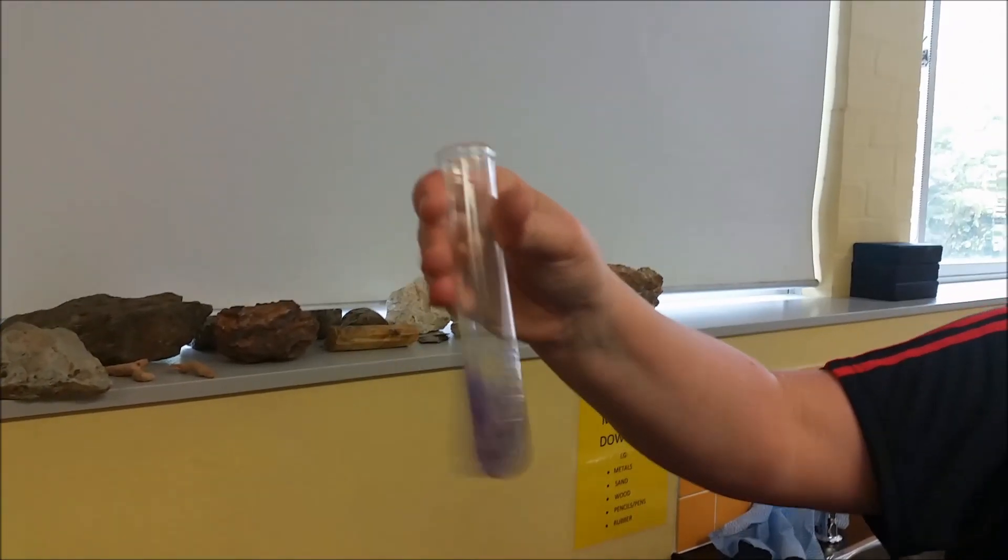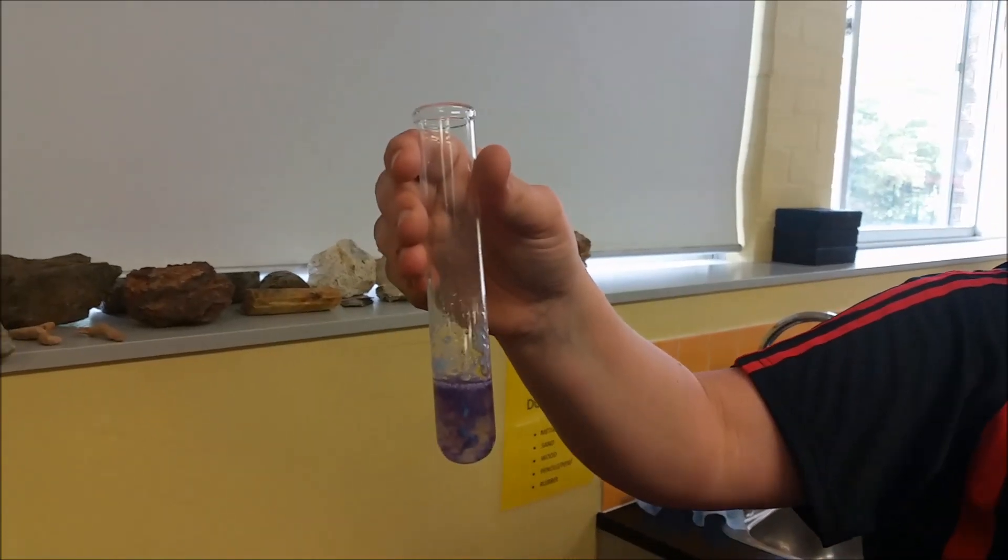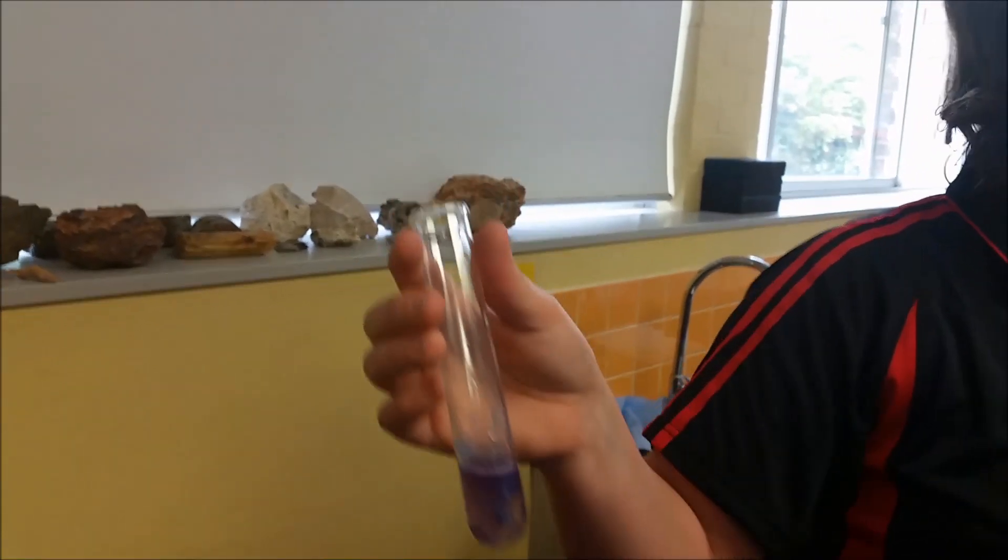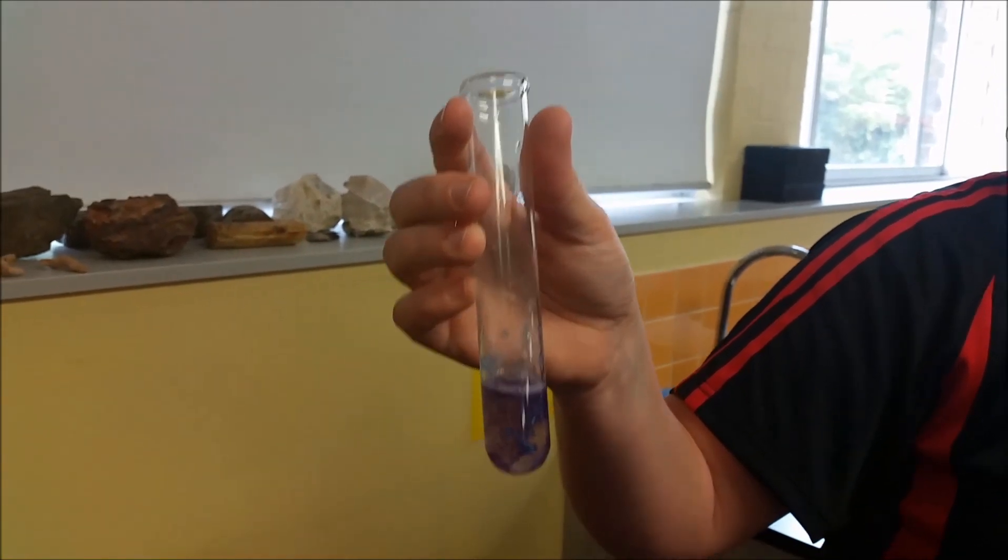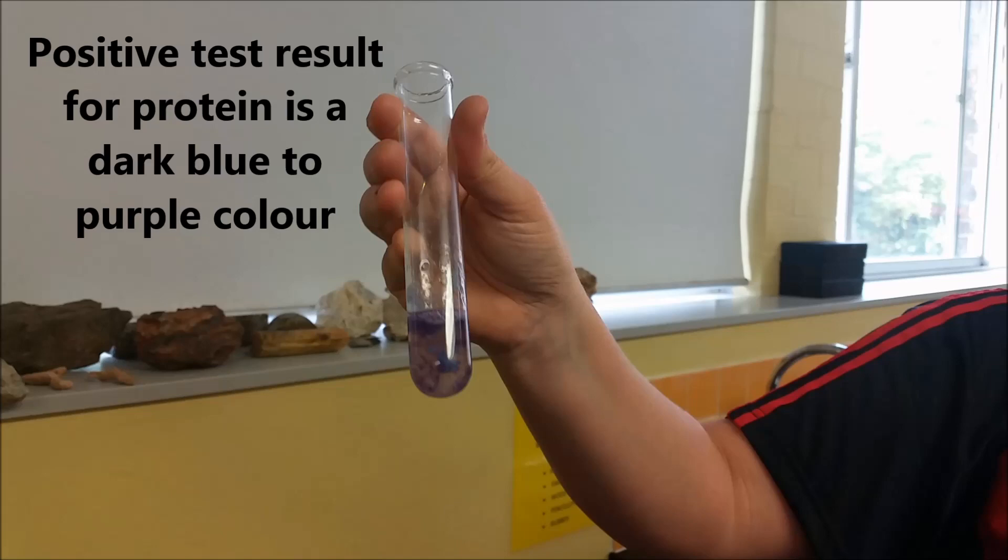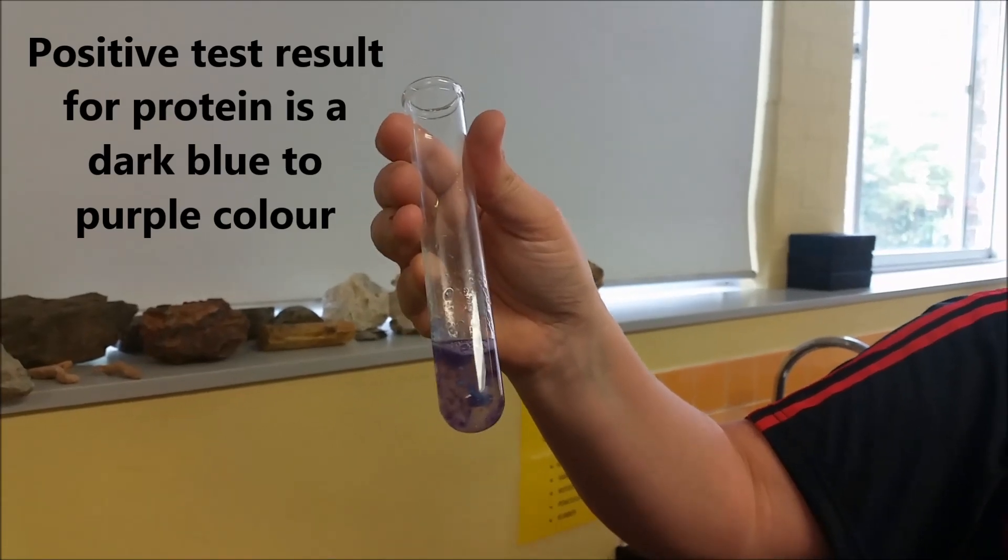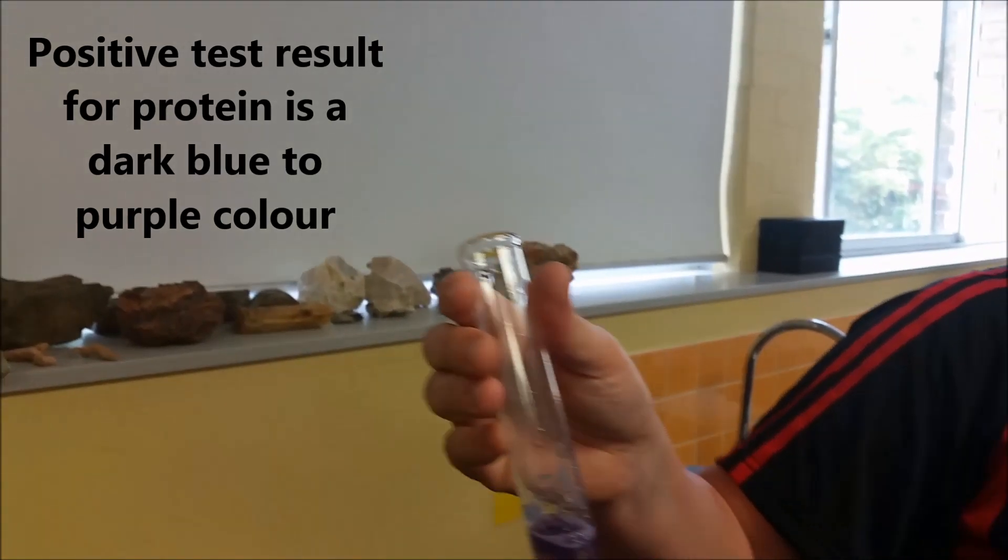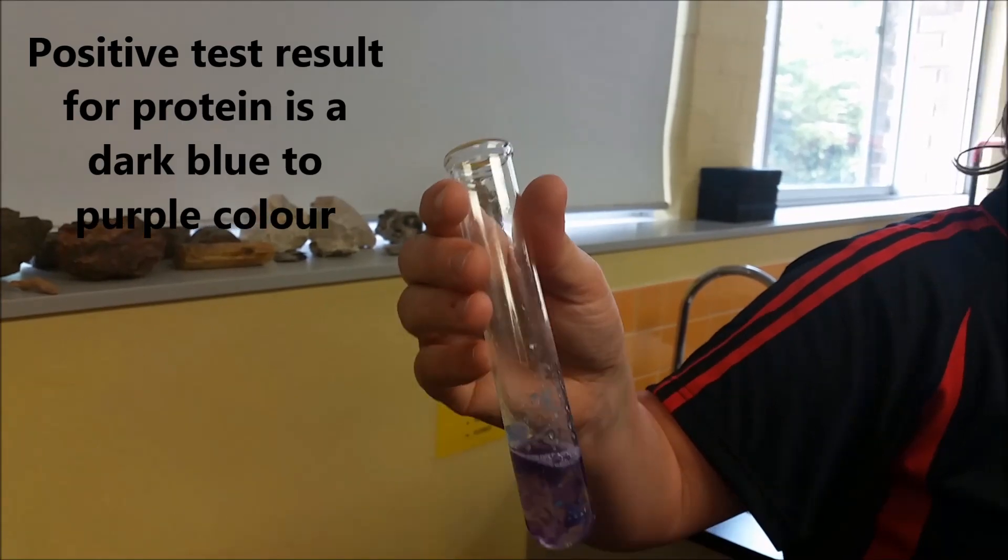When you add the copper sulphate solution to some other things, it'll automatically go blue because the copper sulphate's blue. If protein is present though, it will go either... Now this is... Because this is a strong solution, it has gone quite purple. However, it can go quite a dark blue.